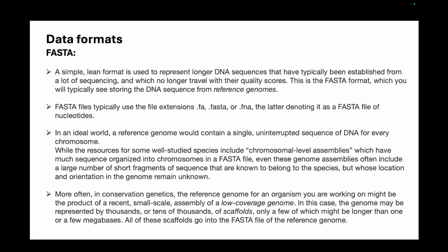FASTA is a simple, lean format which is used to represent longer DNA sequences that have typically been established from a lot of sequencing and which no longer travel with their quality scores. So you do not have quality scores associated with FASTA. You will typically put those genomes in your FASTA file which are 100% confident, the correct sequence.